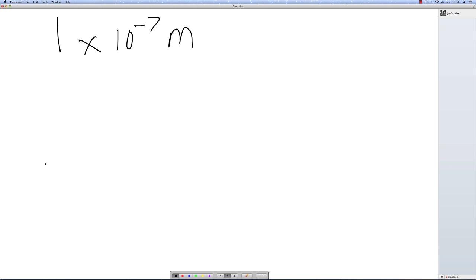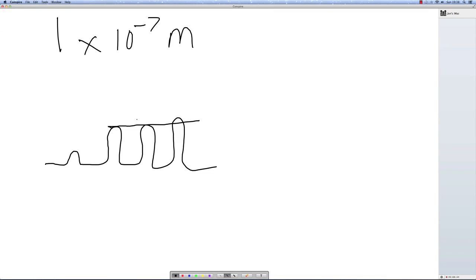And what you might find is that the first peak is quite small, then the second one is a bit bigger, and then the third one, and there you have your 3 peaks. Approximately the same size. They don't have to be exact, but as long as they're close, then you can proceed on to part 2.